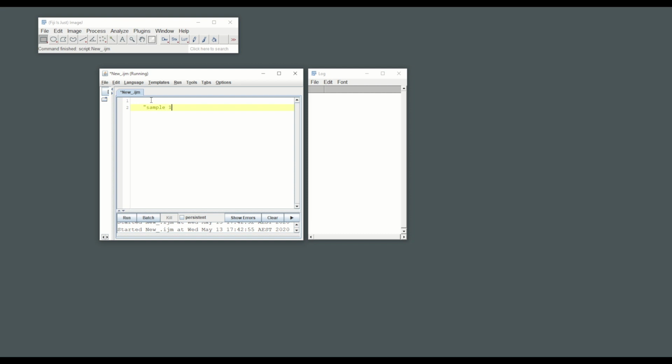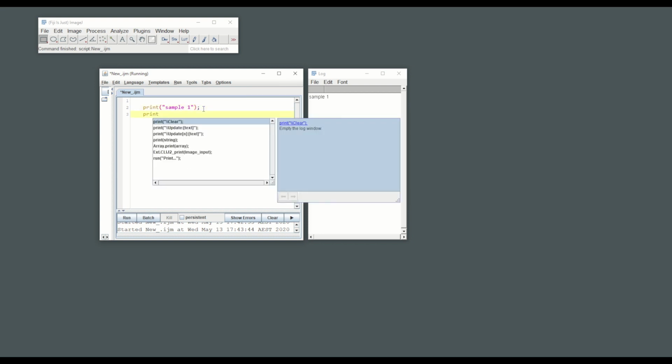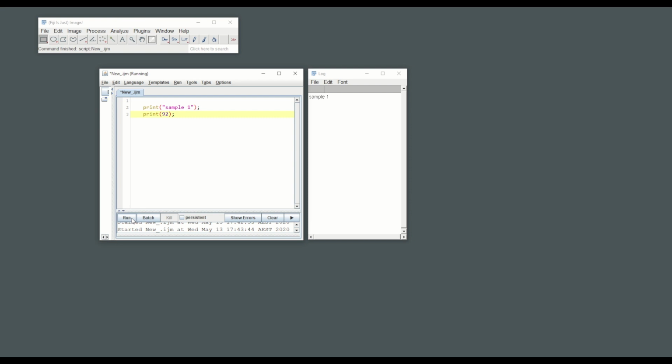We can print out the name alone, and then the percentage. Or we can print out the name and the percentage in the same line. Or we can also add an additional string in between the values to make it clear.